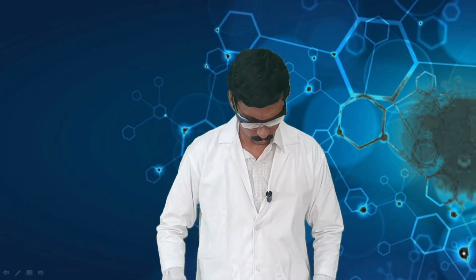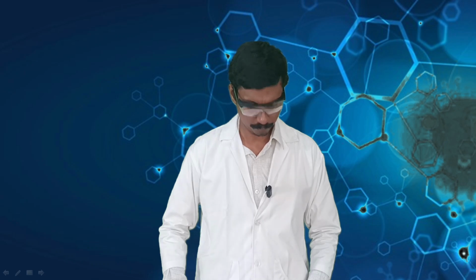I will demonstrate to you how to test for the elements present in your organic compound. We will look for nitrogen. How do you collect the sodium fusion extract using the sodium metal?